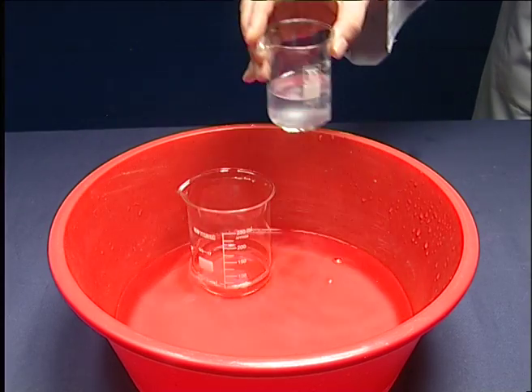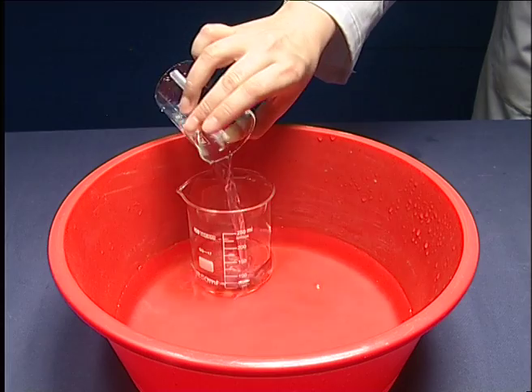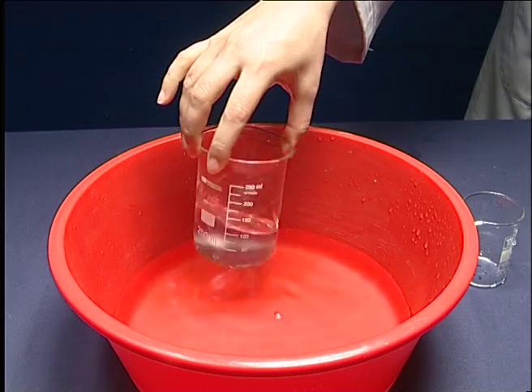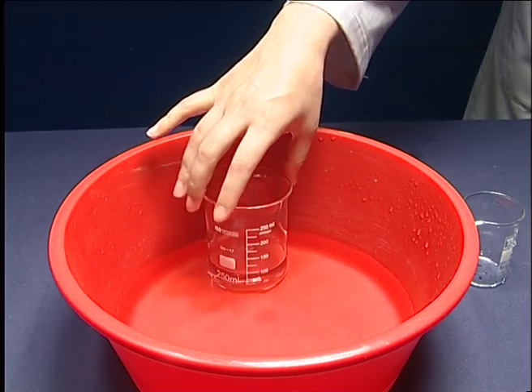Pour the solution in the 100 milliliters beaker into another beaker and shake rapidly. Then keep it in the water bath again and start the chronometer.